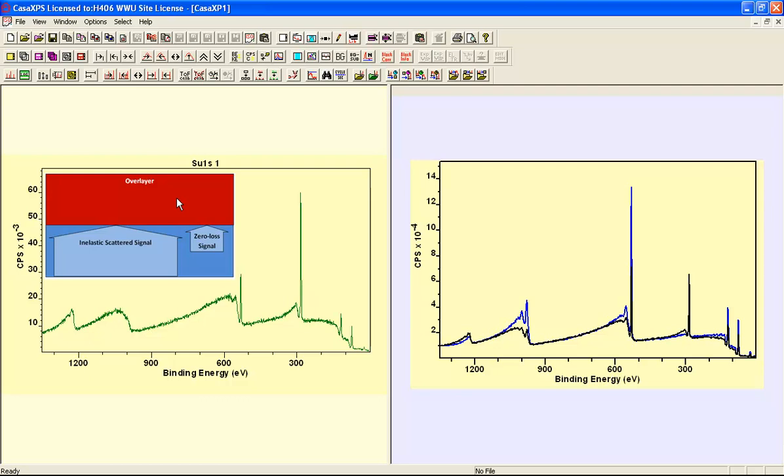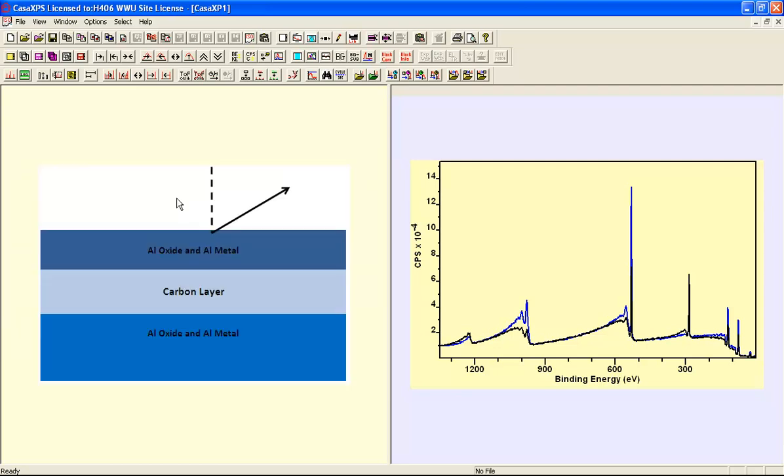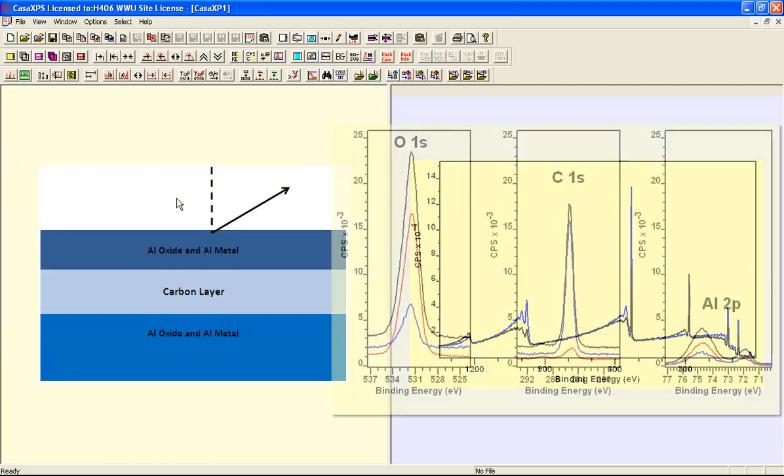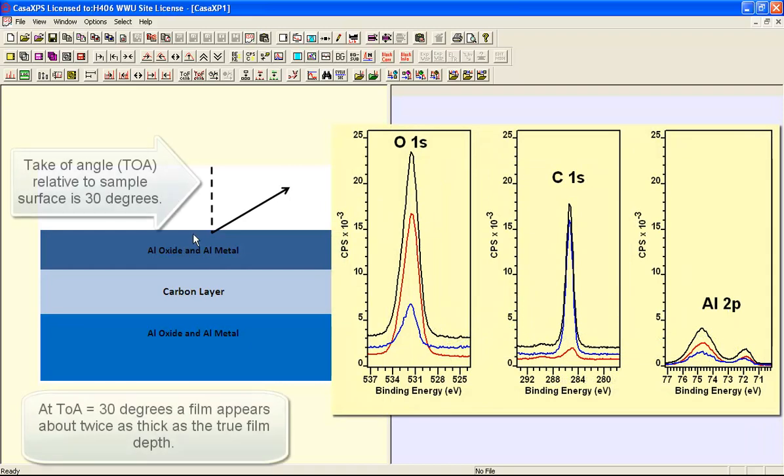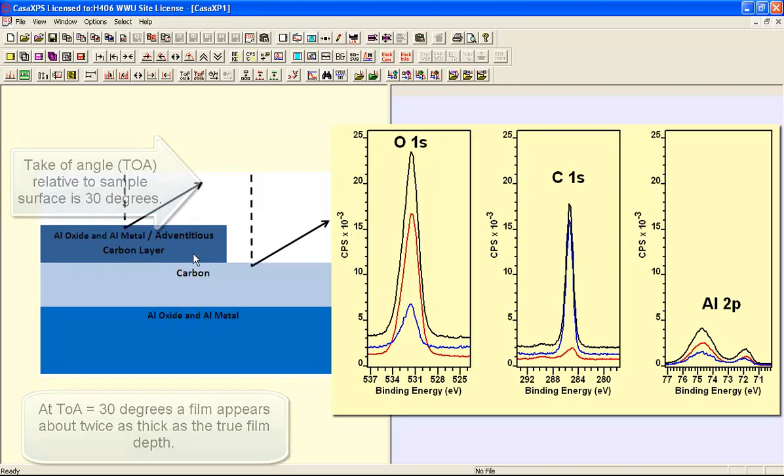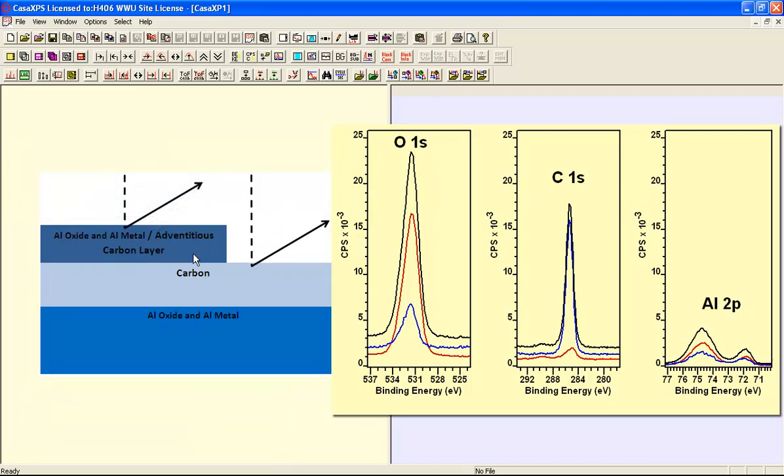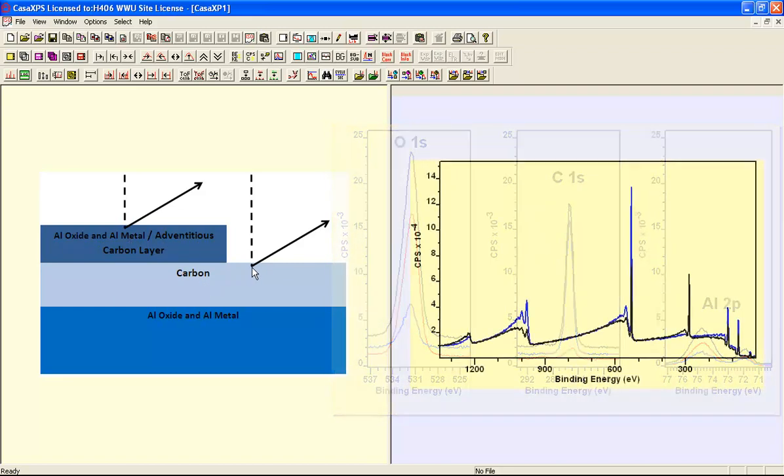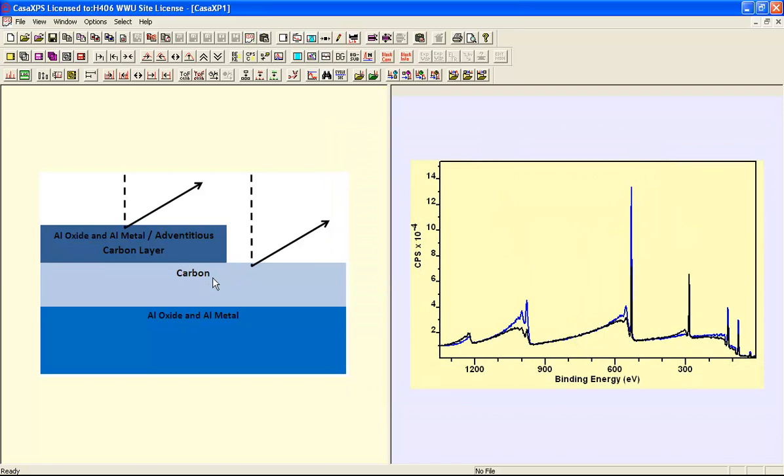However, once we go to the high resolution data, we can see that we've got some aluminium oxide and metal potentially at the surface. So the sample is perhaps along these lines that we have an aluminium oxide and metal, some adventitious carbon, and there's also signal coming from a carbon layer that is sufficiently thin to allow some of the aluminium oxide and metal beneath it to actually appear in the spectra.